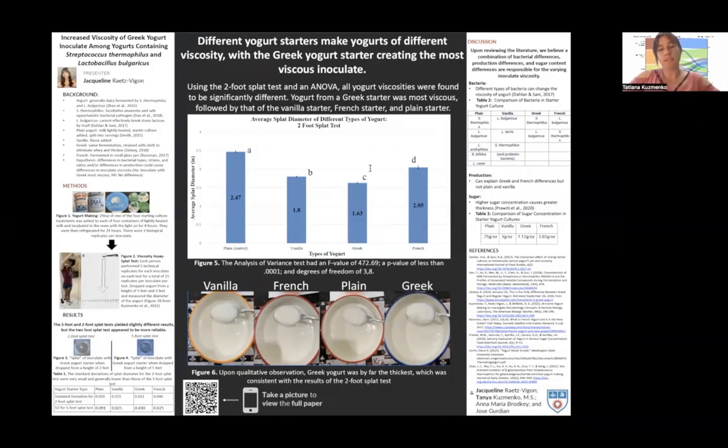I'd like to present here an at-home laboratory activity in which students culture yogurt to explore microbiology concepts that we developed during the remote instruction in 2019. We selected milk fermentation for our remote lab for two main reasons.